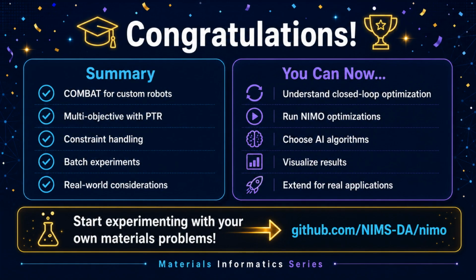Congratulations on completing the NIMO Introduction series. Let's recap what you've learned. You now understand the COMBAT interface for custom robot integration, multi-objective optimization using PTR for Pareto optimal trade-offs, constraint handling through candidate prefiltering, batch versus sequential experimental strategies, and real-world considerations for handling failures and noise. With this knowledge, you can understand closed-loop materials optimization concepts, set up and run NIMO optimizations, choose appropriate AI algorithms for your problems, visualize and analyze optimization results, and extend NIMO for real-world applications.